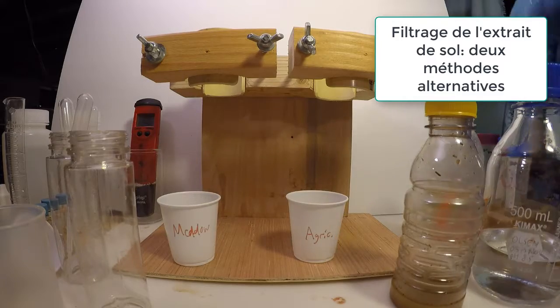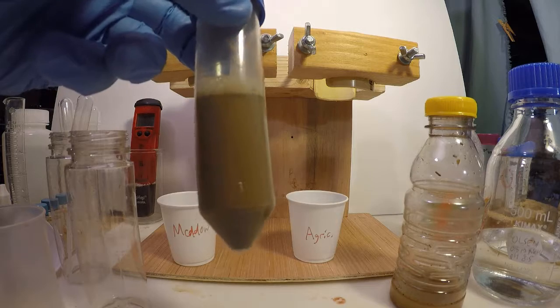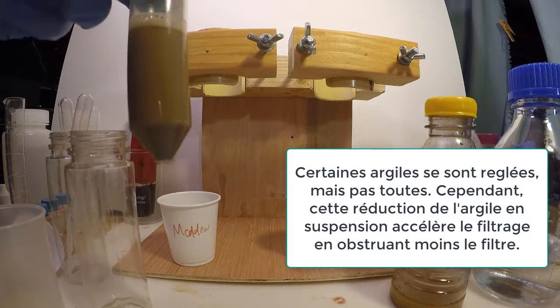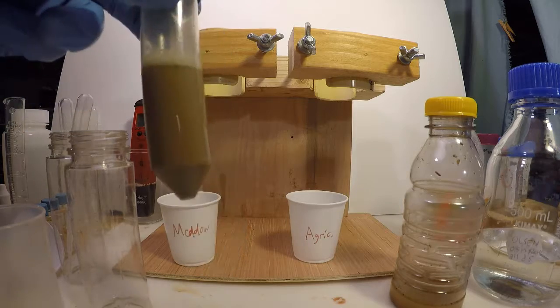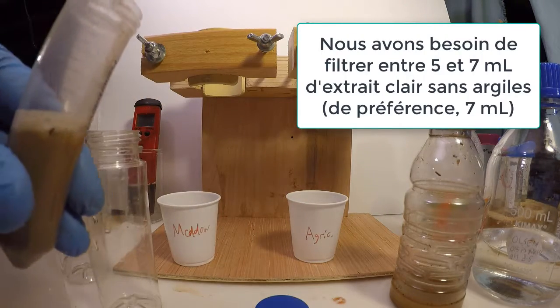The next section shows 2 alternative methods for filtering clays out of a soil extract. The first is more fail-safe, but slower, and requires a lab-quality filter. The second is faster and uses cheaper coffee filters, but may become too slow for high clay soils.